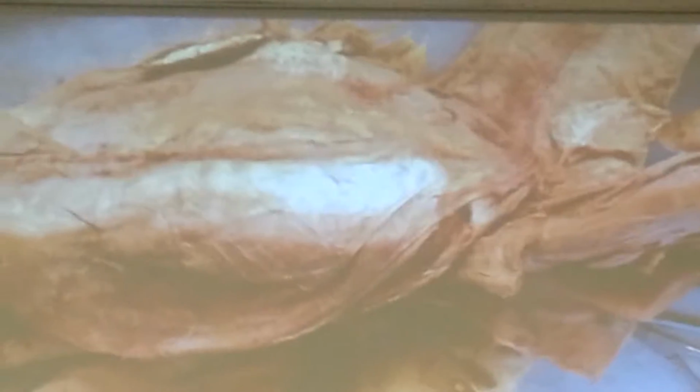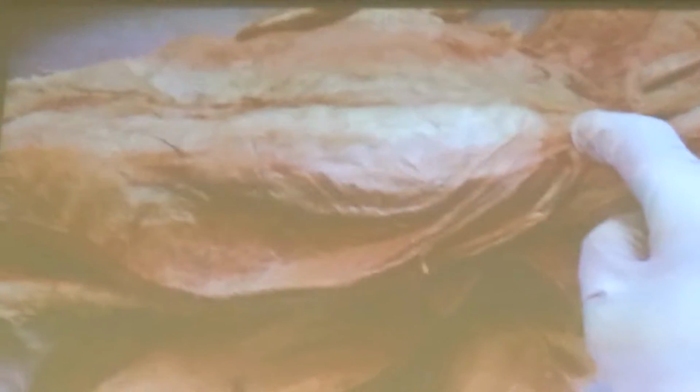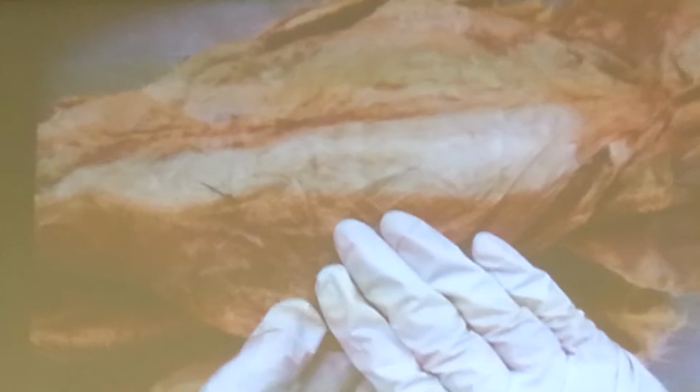Get to the first layer, just start working with this one, and then start opening a little bit with this one, and then continue with the scissor or with the knife, with the scalpel itself. We want to keep the other beneath layers of the other muscles. So you do a cut like this, from here goes toward the lateral, and come here, toward the right. Clear? When you open it completely, this muscle is external oblique muscle, right?